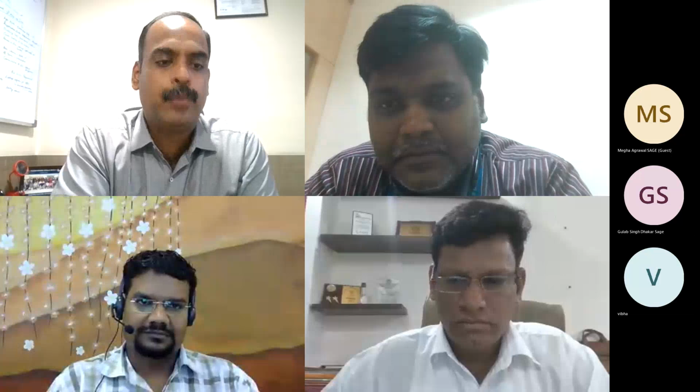Because the interface is still not completed with MedMantra also. If you go for EC also, only one interface is completed and the next interface is under process, so that will also take a little time to complete. So this is all about lab interfaces. If you have something specific, I can answer. Otherwise, I can move to the next area.